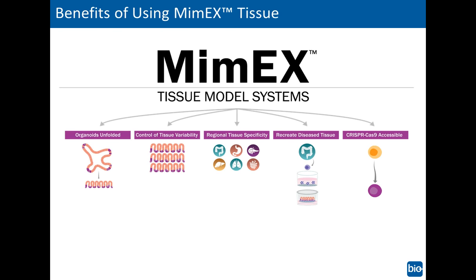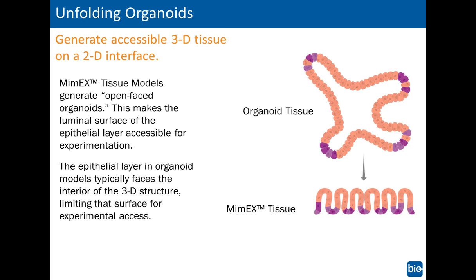So MimEX offers numerous benefits, and these I will go into detail in the following slides. This includes the accessibility, the consistency of the tissue, the regional specificity, the recreation of diseased tissue, as well as the possibility for gene editing.